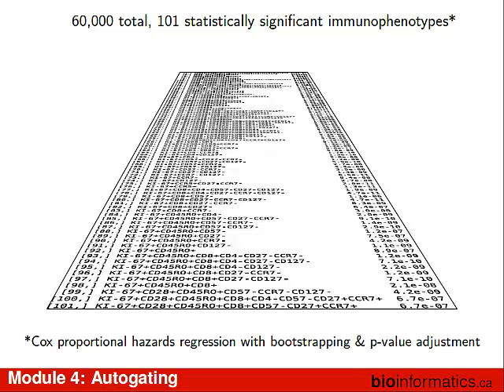This potentially is a really important phenotype. And the problem we had is, which one? It's like doing microarrays all over again, right? We're going to find lots of stuff. Which one of these is the one that you want to follow up on? Because there's just too many. You're not going to follow all 101.